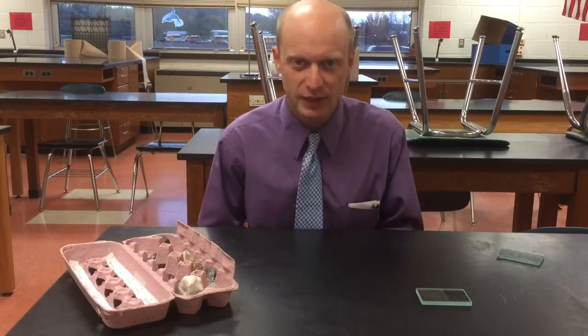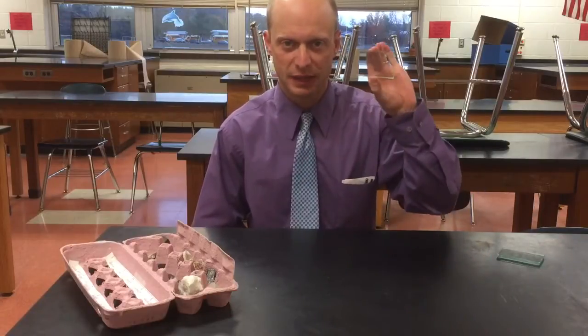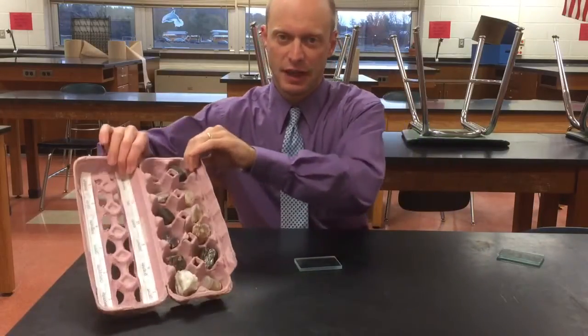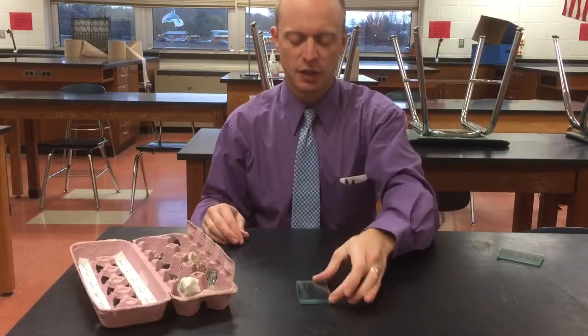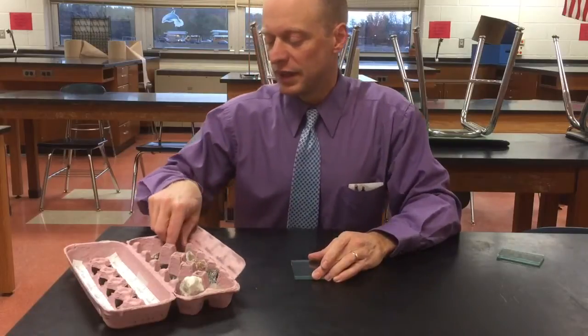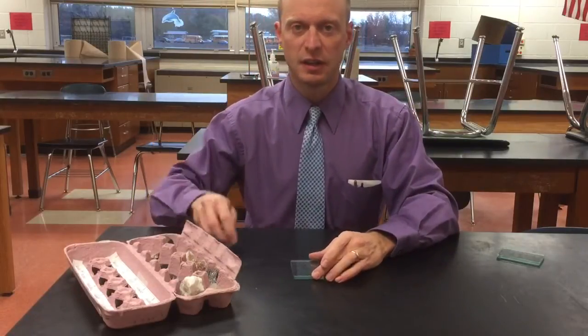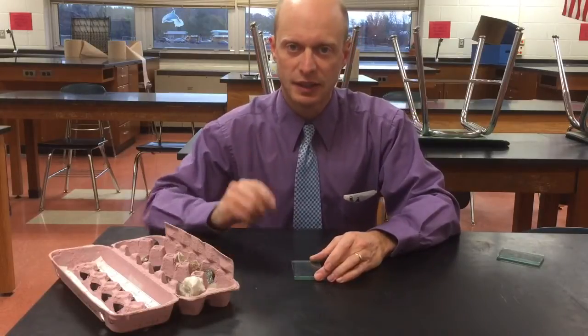Today we're going to learn how to scratch a glass plate with a mineral — this is a hardness test for minerals. You want a glass plate like this. I have some minerals here. What you want to do is get your glass plate, hold it firmly. I'm going to start with this one right here: talc. You're going to drag this on the glass plate.